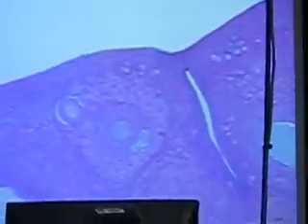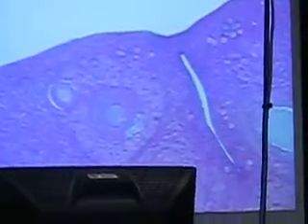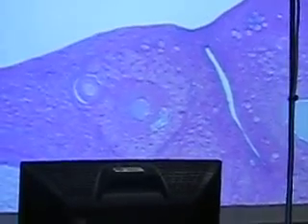Want to take a look at the slide of your ovary. Probably will have a couple of slides of the ovary in your boxes. What I want you to be able to do, for starters, is make sure you can differentiate the various levels of maturation of the ovary.